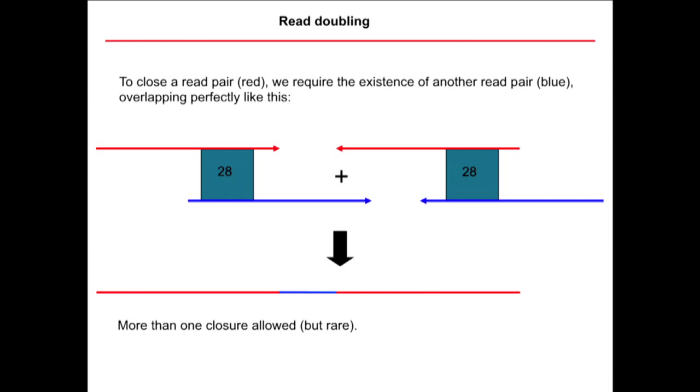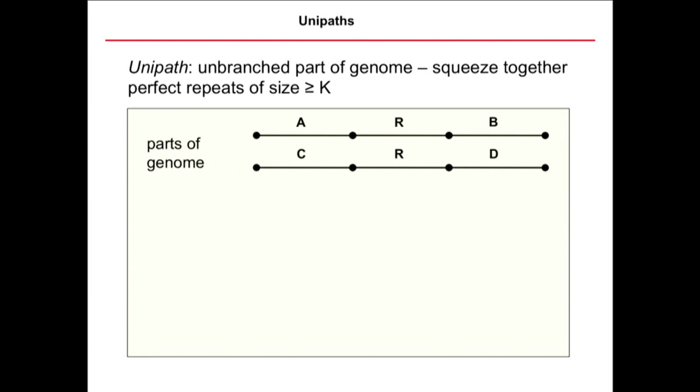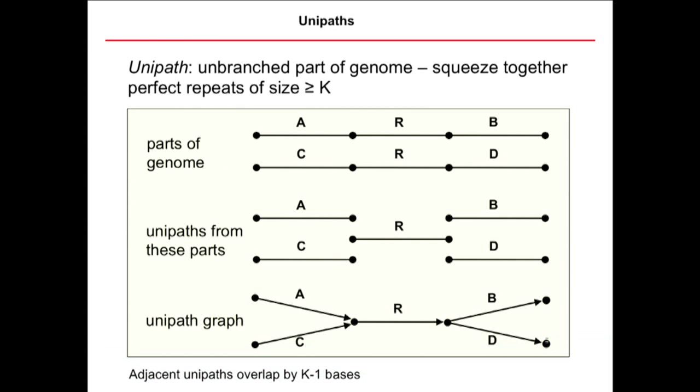That procedure is actually extremely effective with Illumina data, which is dominated by occasional substitution errors. So now that we have more or less perfect data, we can go ahead and take those overlapping pairs and merge them together. It tries to do an overlap there. If necessary, it'll look for a third read to confirm that, in case there's some sort of tandem repeat right at the end. That's built into the algorithm. And then, exactly like we saw with that Dickens graph, we take these merged pairs and build a De Bruijn graph.